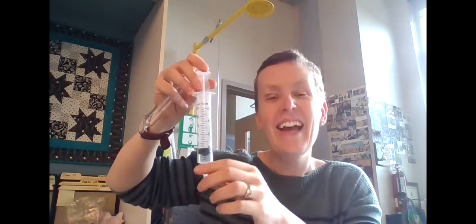Okay, so this lab is going to use a setup that looks like this. We have a test tube and we're going to have sodium bicarbonate in there, and that is baking soda. If you didn't know that, it's baking soda. And we're going to have a syringe in the top. The syringe we are going to use to draw up about 5 milliliters of acetic acid. And then we're going to stopper this test tube.